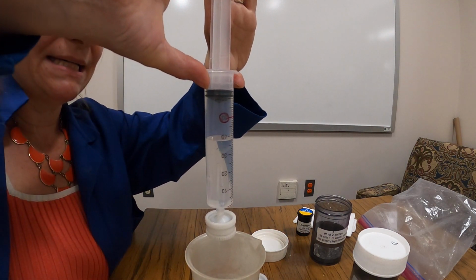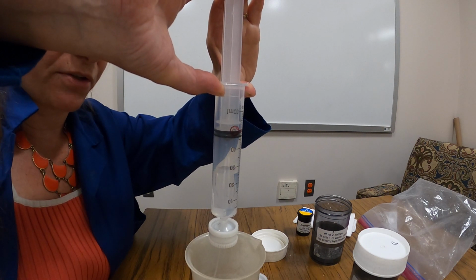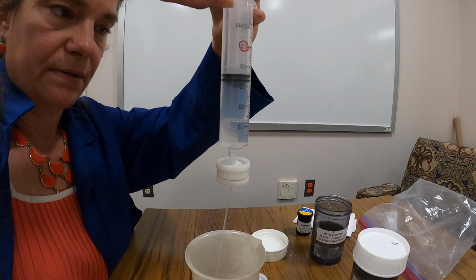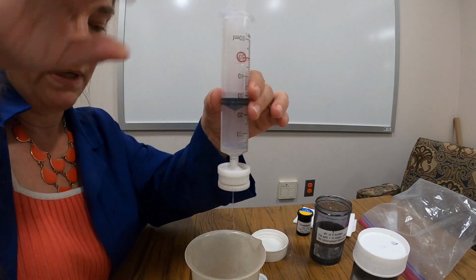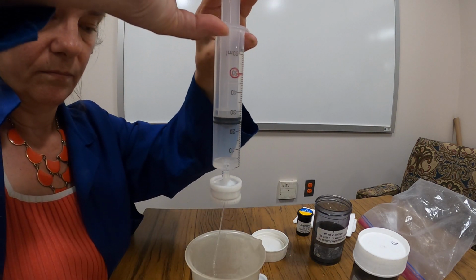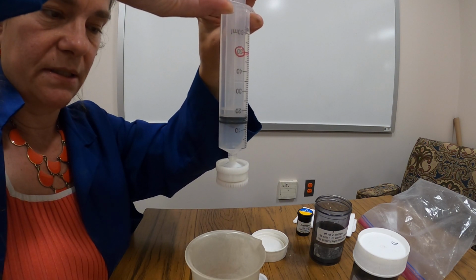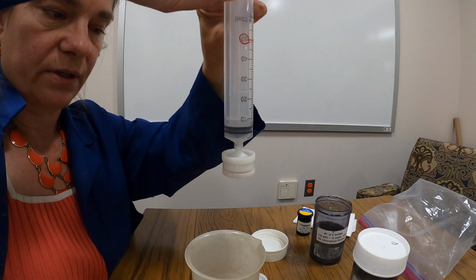And then with a nice, steady, even, slow pressure, I'm going to force all of that 50 mils of water through. I want to make sure that no water is leaking through here. And when I get to that air gap, I'm just going to keep on pushing. This gets rid of all of the excess water.